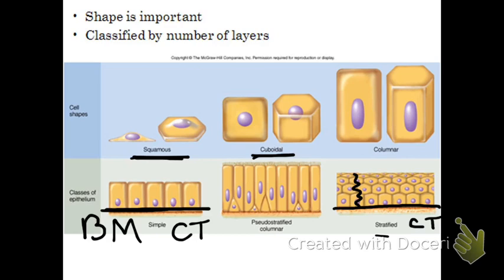Now, the pseudostratified columnar tissue, which we'll be looking at today, here's that basement membrane. Here are the epithelial cells above. Here's what's odd about this tissue, is that it's called pseudostratified, and that name should tell you that it is falsely stratified. At first glance, it looks like there's a couple of different layers of cells, right? It looks like there's a layer of cells here and another layer of cells higher up. But in fact, if you look at this more carefully, if you could go in and take a look, every cell here is actually connected down to the basement membrane. So while it looks like there's more than one layer of cells, every cell is adhered individually to the basement membrane. So it is called pseudostratified. And because the majority of those cells are tall cells, this phrase goes together, pseudostratified columnar epithelium.